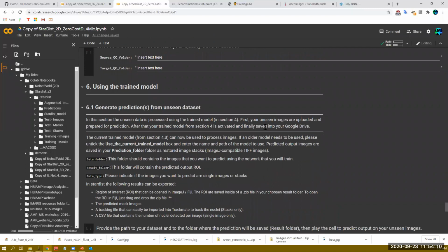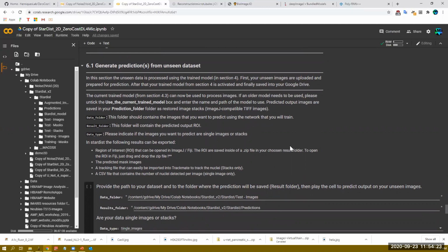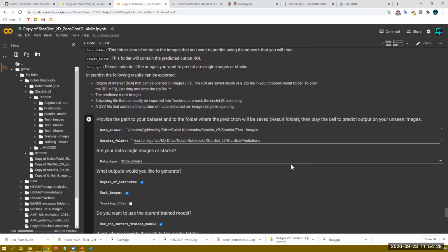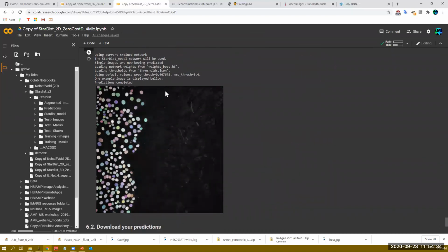And then at this point is when you would feed your model the test set for predictions. So the unseen data set, which is the small quantity that you split off from the main data set, that's my test images. So, and then you click through, and boom, this is, say, an example of what the model was able to do.